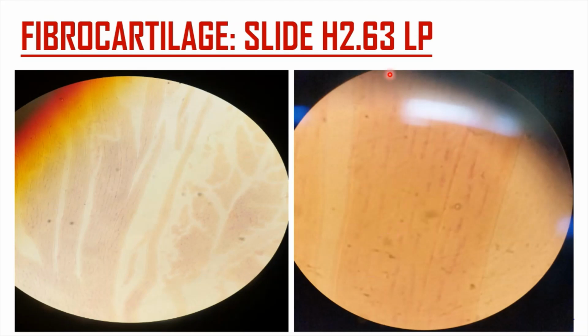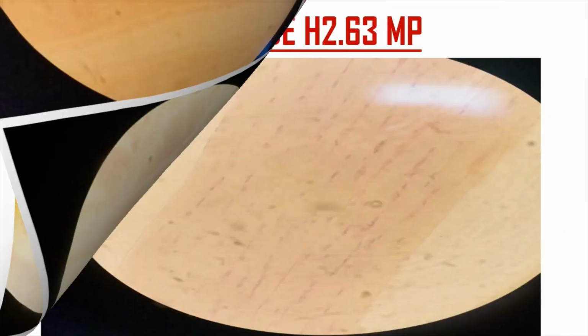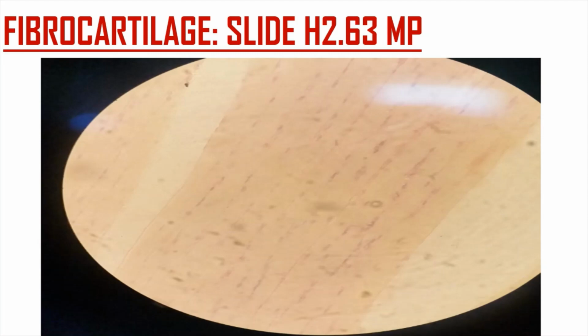Okay, so just sketch this and label this as dense regular collagen fibers. Embedded in them are lacunae containing chondrocytes. Okay, this is a medium power.